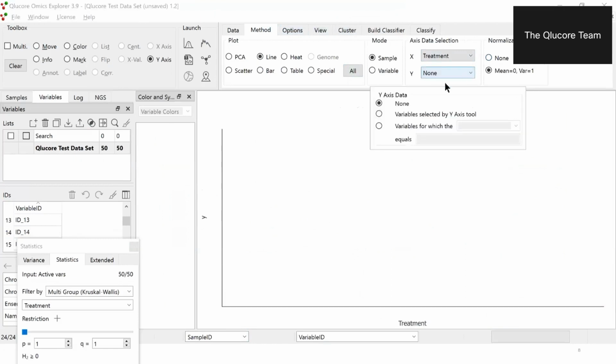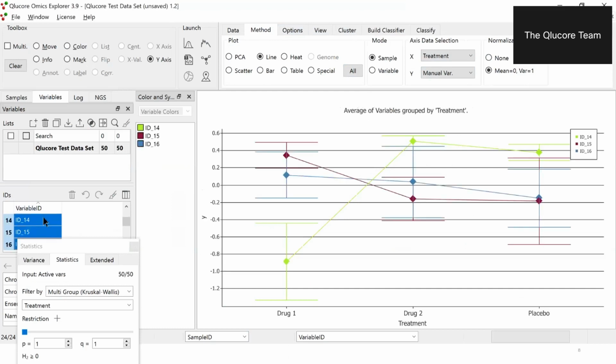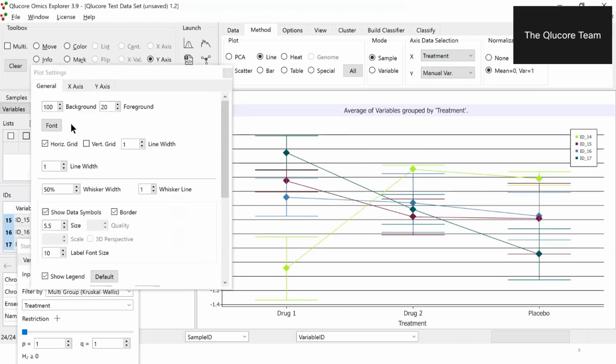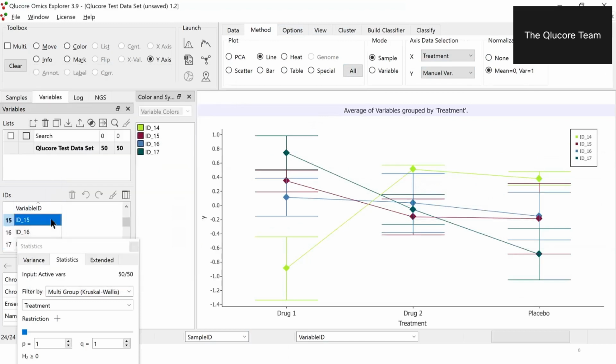And again, we need to pick which variable we are working with, like that. And in this case, you are probably interested to show several variables in the same plot, maybe. Let's take away the grid here. There's too much information. So now you can see, let's focus on one.